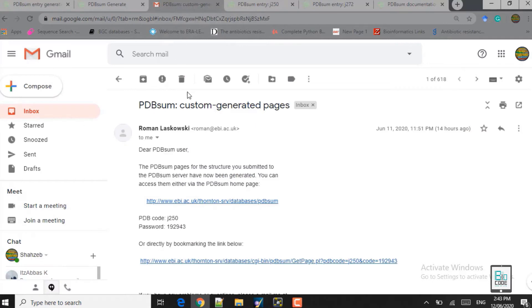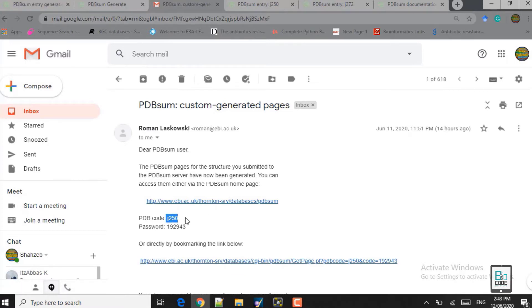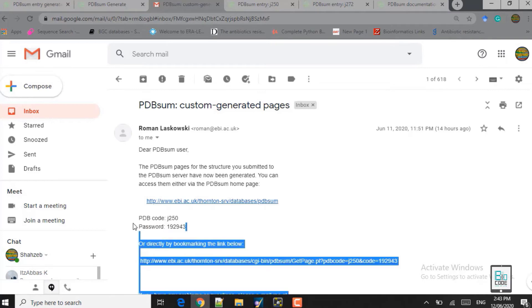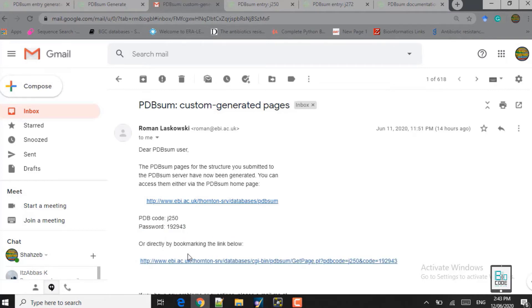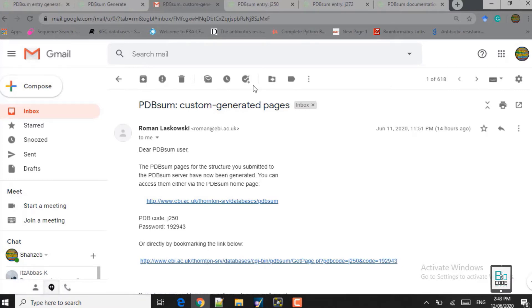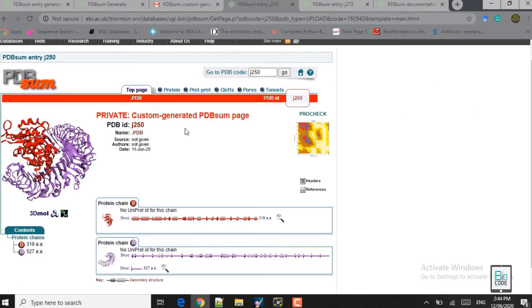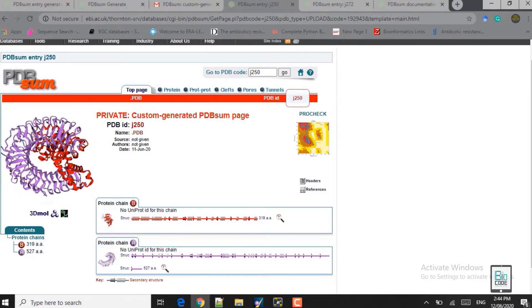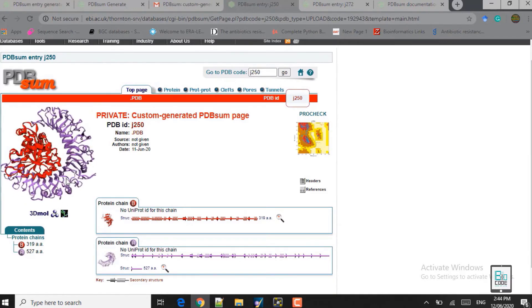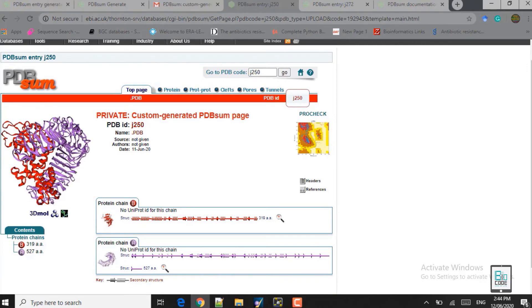So the next thing you're going to do is check your email inbox after 10 to 15 minutes. Here you can see I have received an email from PDBsum. I can access the results by clicking on the first link and providing the PDB code and password generated for my structure, or I can simply click on the second link and it will take me to this page. Here you can see the structures I have provided.